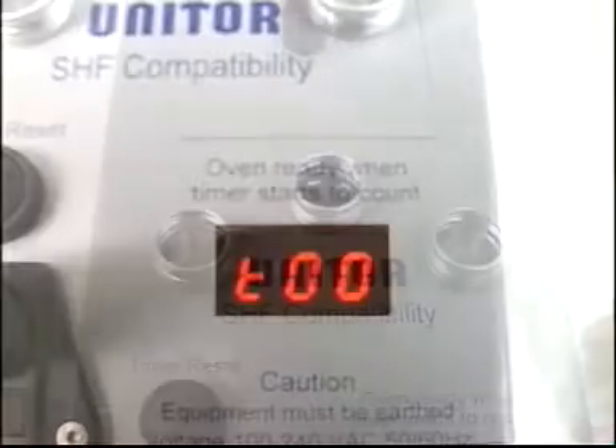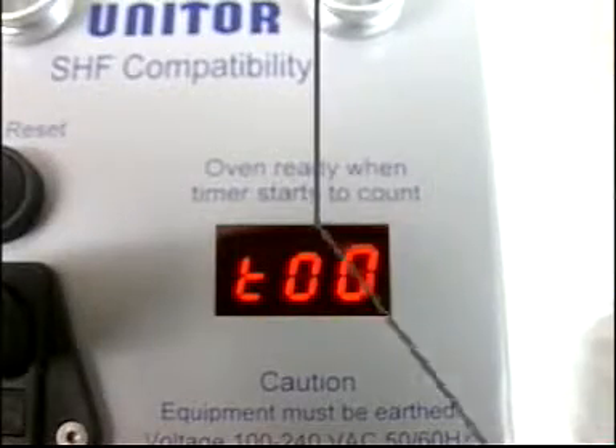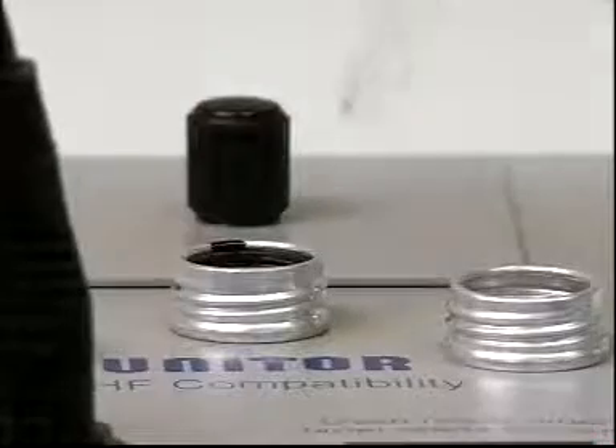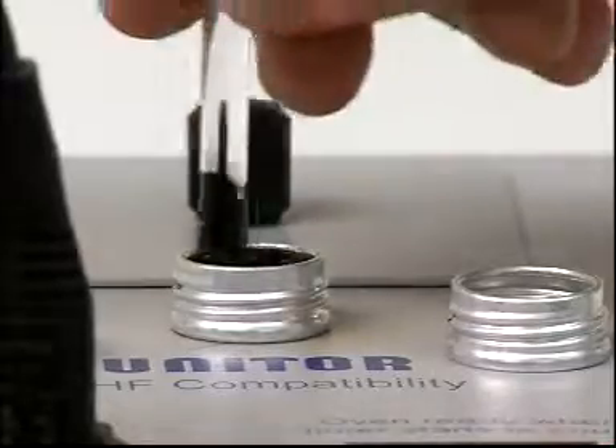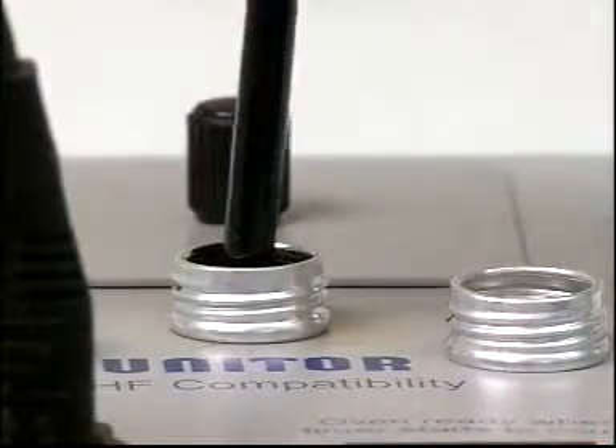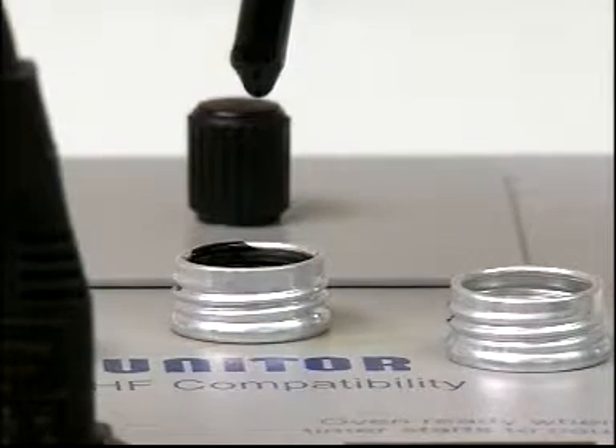After the unit is fully heated to 100 degrees, place the tube in one of the preheat holes. Press reset, then wait for the timer to count to 20 minutes. Have some test paper ready. Stir the oil with the rod provided for five seconds, then remove it without touching the sides of the sample tube.